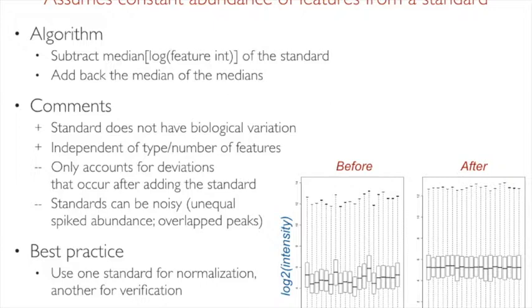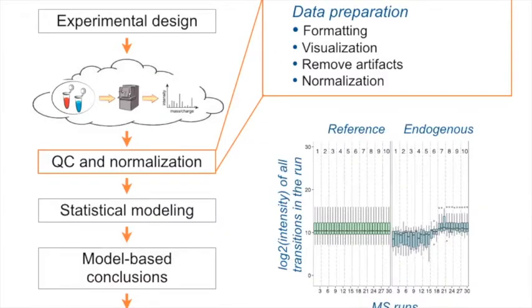You can have a single standard and then you would equalize that, or ideally you will have many standards and then you can use quantile normalization on the standards. So your choice of normalization will depend very much on what type of experiment it is, how many features you have, and how many of those features are actually changing. Define many versus few features.